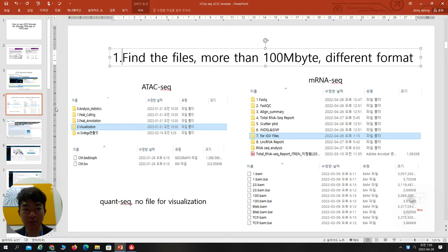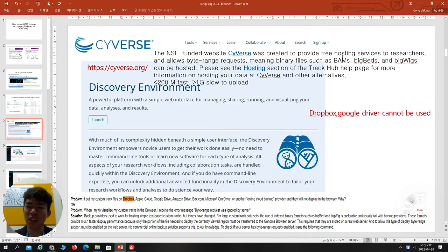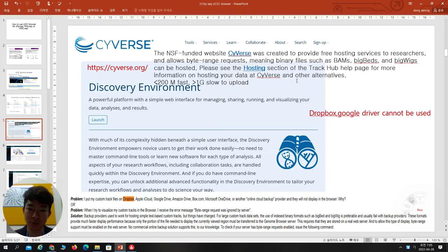Once you find the file, you have to go to CyVerse. This is a public website for uploading your files for free. You cannot use Dropbox or Google Drive — they cannot be used. As far as I know, only CyVerse can be used. CyVerse is an NSF-funded website created to provide free hosting service to researchers, and it allows byte-range requests. The UCSC browser only uses byte-range requests, meaning binary files such as BAM, BigBed, and BigWig can be hosted there.